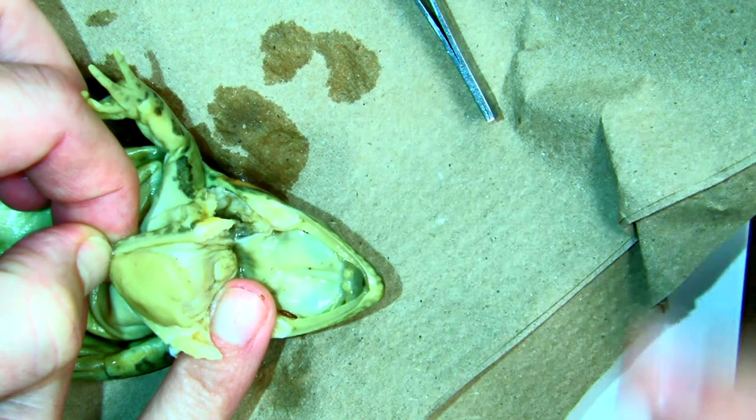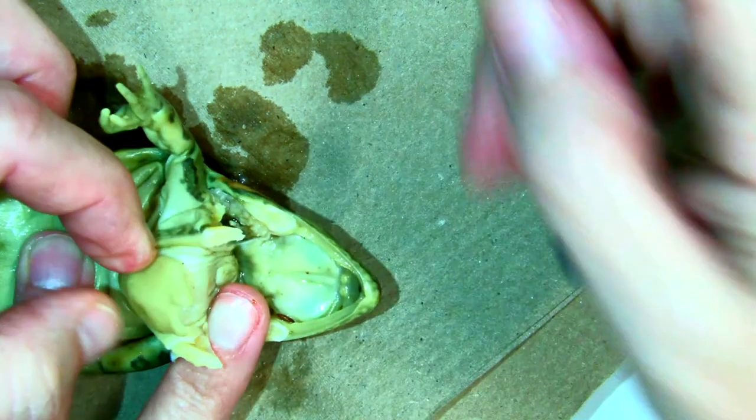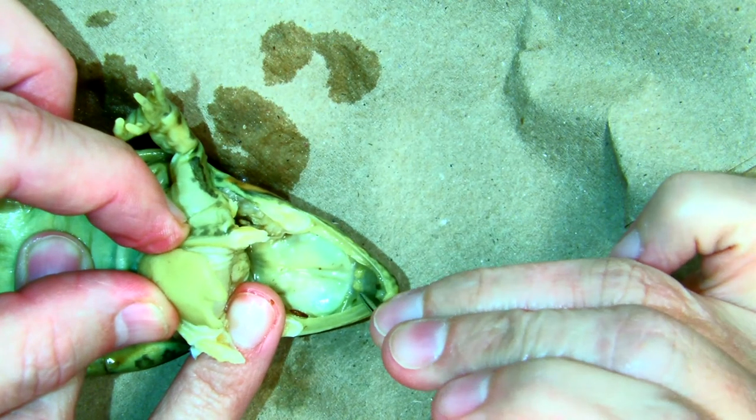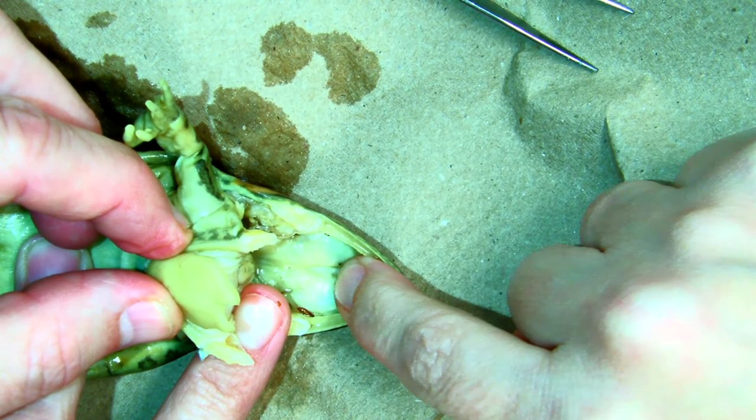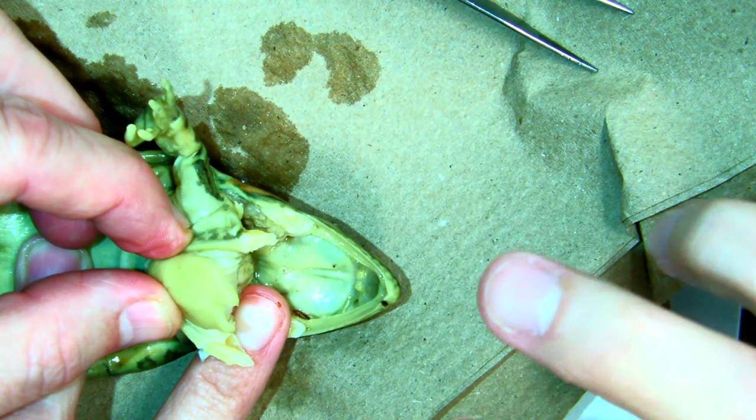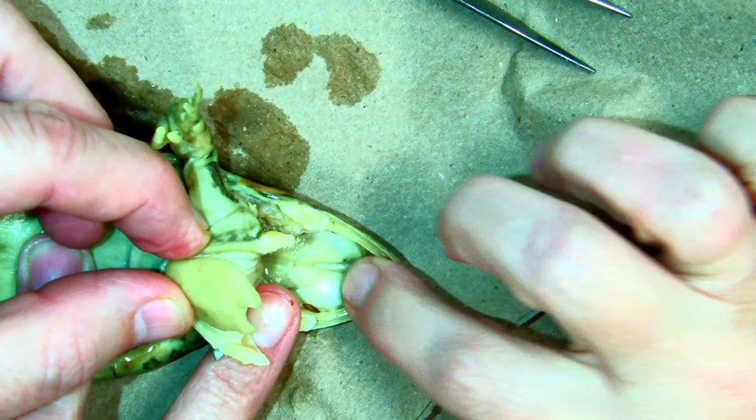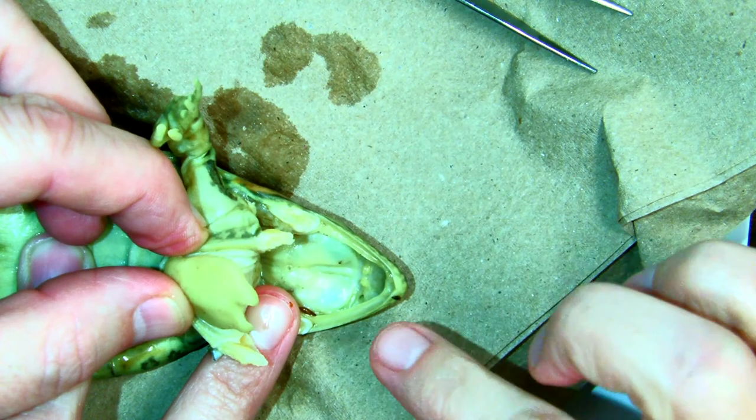And then the last thing that they have to keep prey in their mouth and from coming out are these two little bumps here. These are called vomerine teeth. And if you get your finger and act like you're prey in there and kind of try and get out, you can feel that they're almost like Velcro. They're not letting the prey come out. It's not meant to break up the prey. It's just meant to hold on to them because they swallow their prey whole.